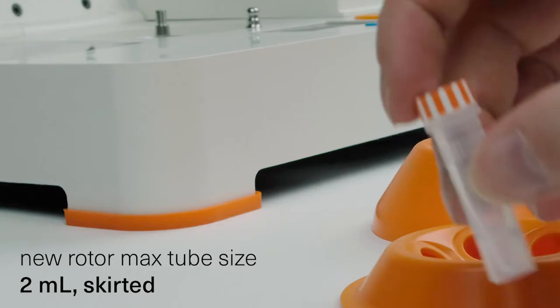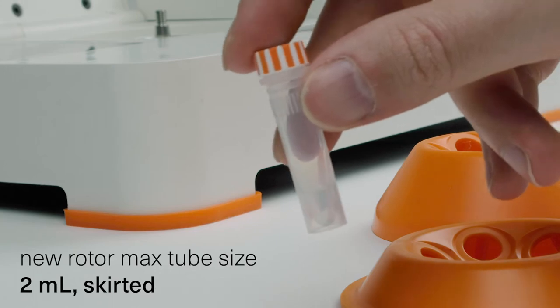Now, with the updated 2 milliliter rotor design, the tubes can be skirted and they can have volumes of up to 2 milliliters.